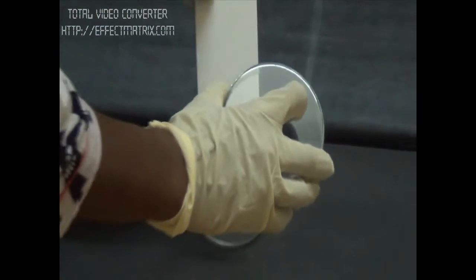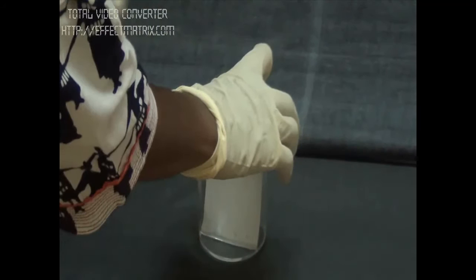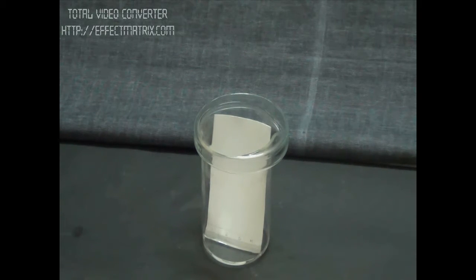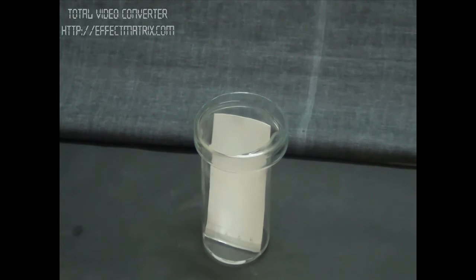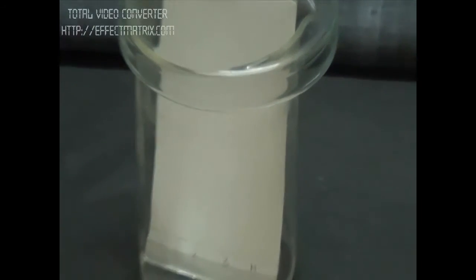This solvent system contains butanol, acetic acid, and water in the ratio of 8 to 2 to 2. On the basis of affinity towards water, butanol, and acetic acid, amino acids will separate. Acetic acid also functions to provide humidity in the chamber.